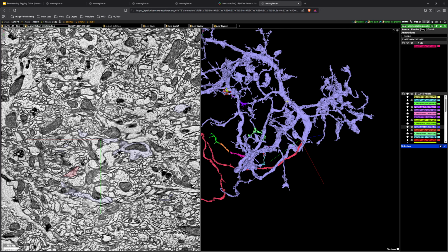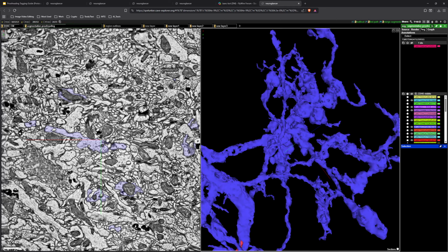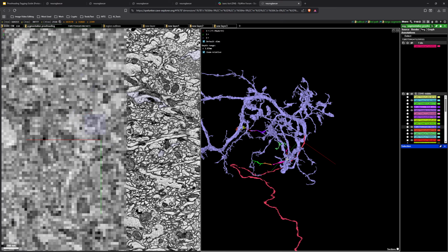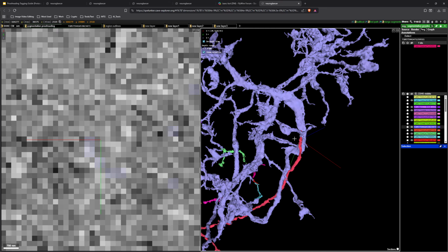And when it's stockier, with a thicker width and shorter branches, that's when you typically get these dense axonal boutons that just go like, I occupy this region. I only synapse here. I'm not going anywhere. I'm just going to live right here forever. For whatever reason, just to anthropomorphize the cells a little bit. And by doing that, we can do the same can't trace to Soma math in our head, right?